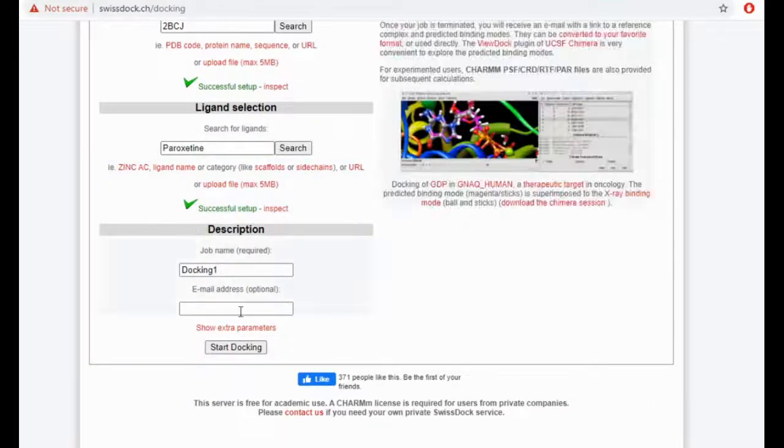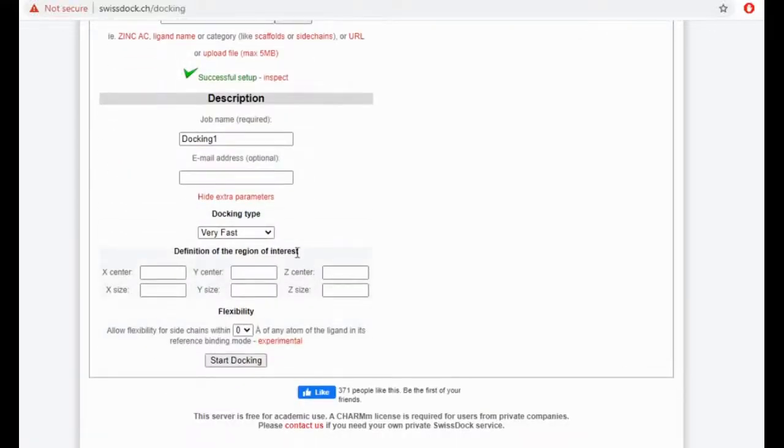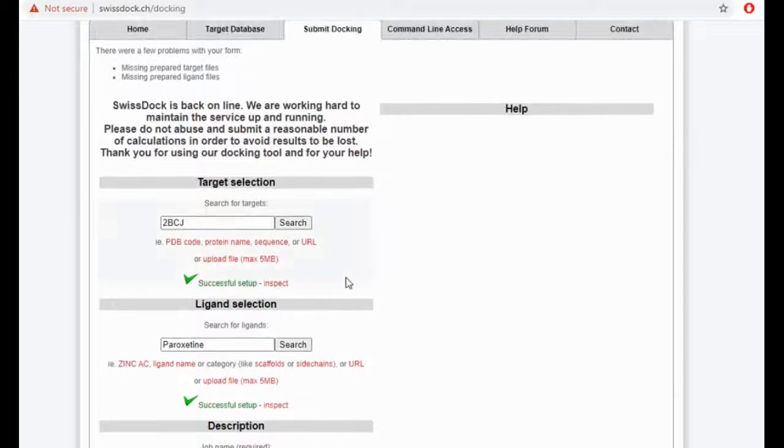And finally, as I said, you have these extra parameters where you can select: 'I'm feeling lucky', 'very fast', 'fast', or 'accurate'. You can also set the different X, Y, Z axes and your flexibility. So this is the same thing — the look and the feel is exactly the same as how it is on mobile.